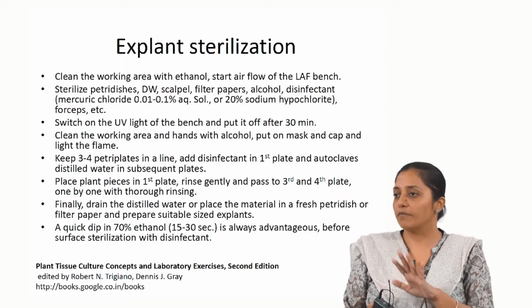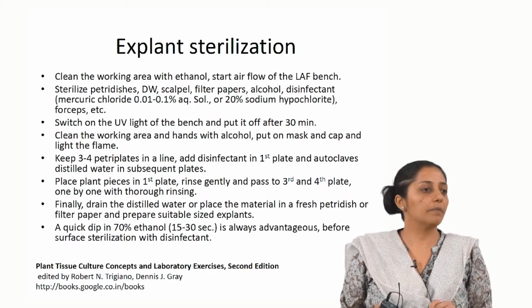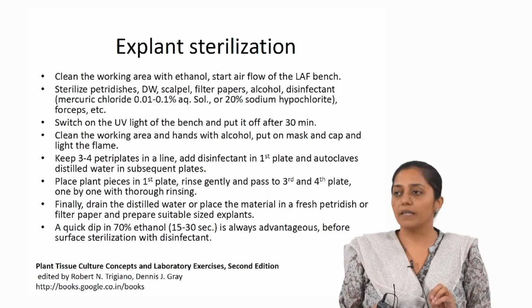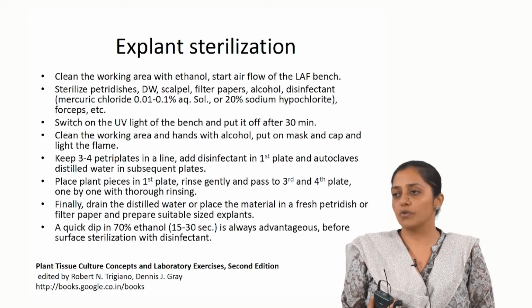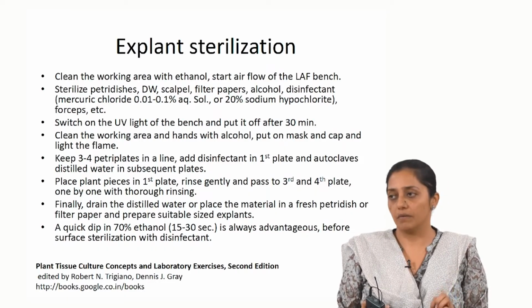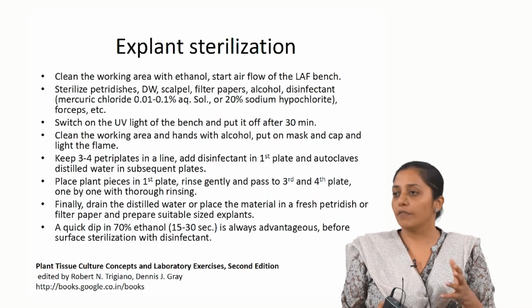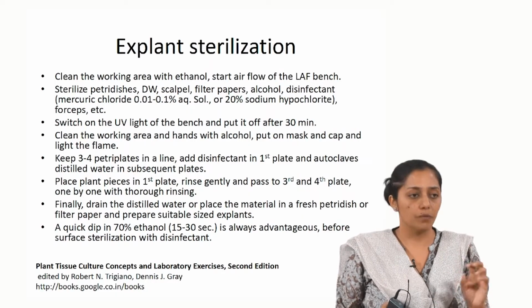Once the surface contaminants have been removed by water wash, before you treat the explants with the disinfectant, a treatment with a wetting agent is given for 15 to 30 seconds. After treating with the wetting agent, the ethanol is removed by water wash; intermittent water washes are given after every treatment. Then you treat with disinfectants. The disinfectants generally used in plant tissue culture are sodium hypochlorite, up to 20%, or mercuric chloride, 0.01 to 0.1%. The exposure time and concentration of the disinfectant have to be optimized depending on the species, whether you are working with a tree species, an old explant or a young explant.